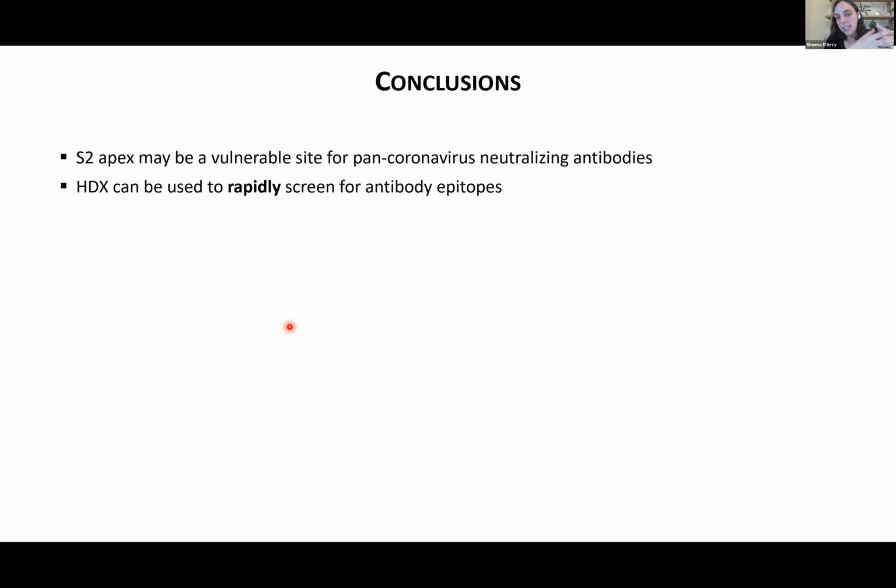Yeah, I should also add that I know that there are people looking at the hydrogen-deuterium exchange of the actual modifications as well. So working out the fundamentals of sugar HDX. So that's a completely different perspective.